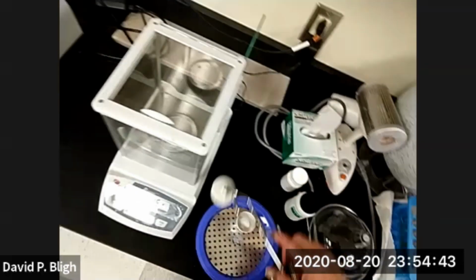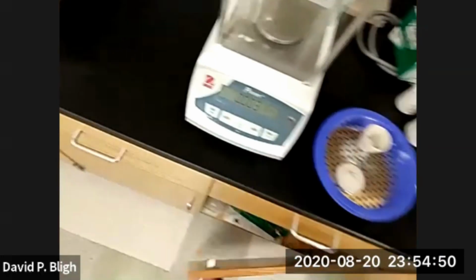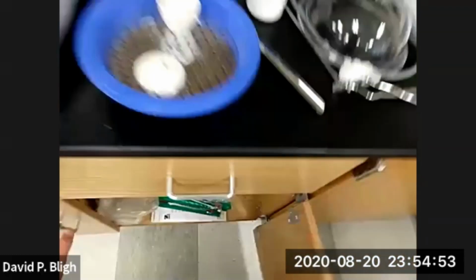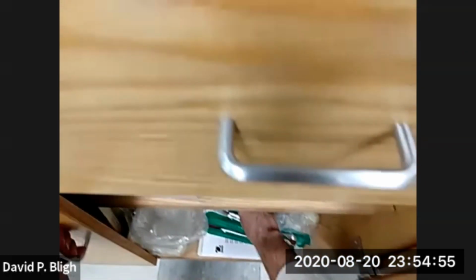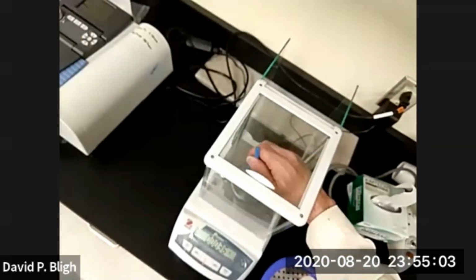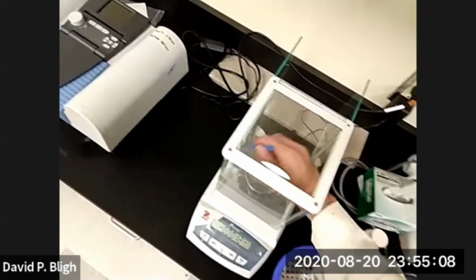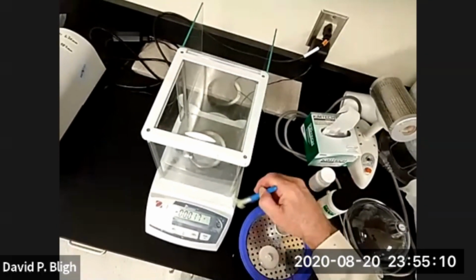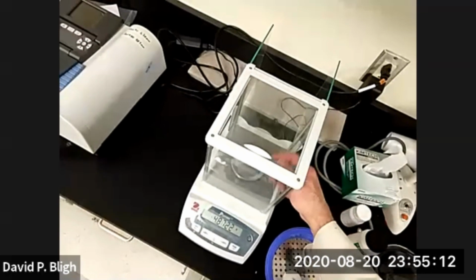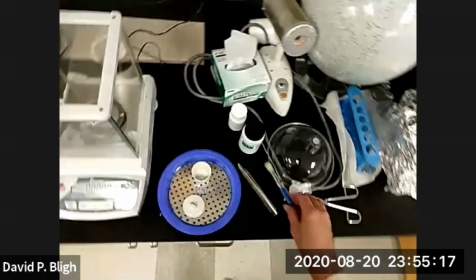We don't even have to put the lid on it. See, I've got some error introduced. I introduced some error. The spillage. So we just recognize that there's error there, and in the interest of time, we're going to let it go.